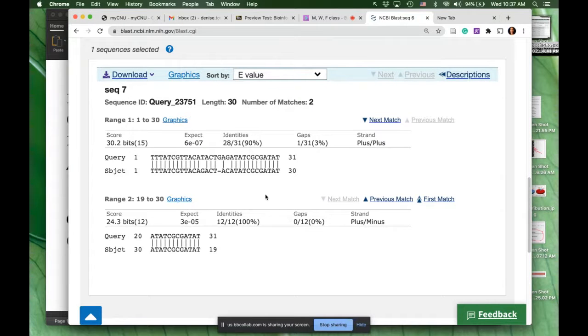Sometimes both of these are relevant, but because we're just comparing one string, we know that this is not a repeat in some other part of the chromosome. This is just two reads of the same DNA fragment that we are trying to align to make a contig.